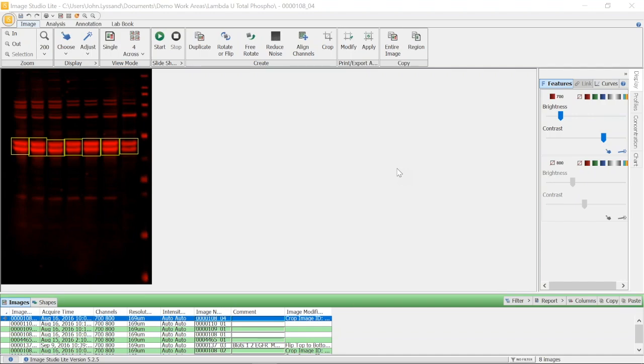Here in this example, we have the result of a Western Blot experiment loaded into Image Studio Lite software. In this experiment, 20 micrograms of lysate was loaded into the first six lanes.